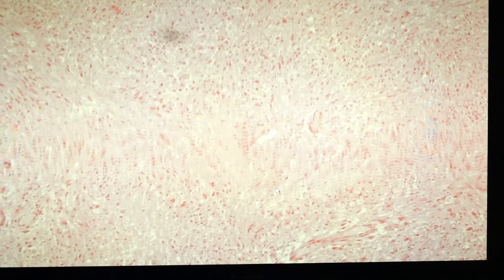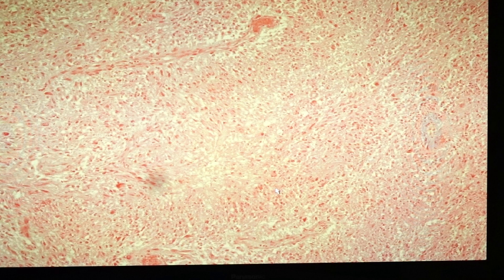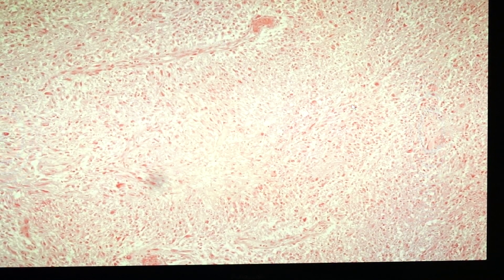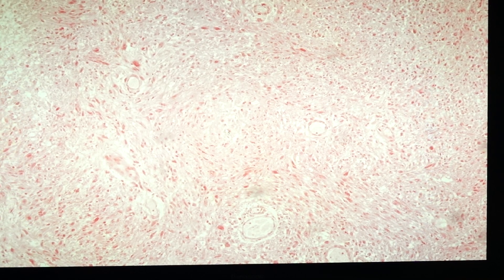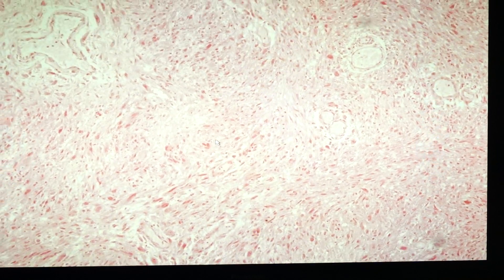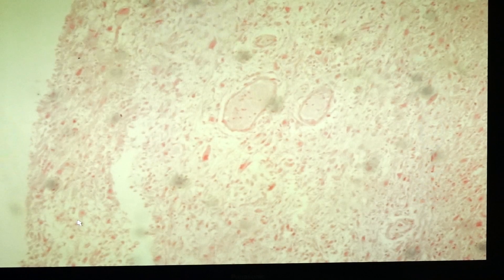Here is another necrotic area in the middle with pseudopalisading of the cells. There are multiple such areas — each is a necrotic area with pseudopalisading surrounding it. There are also aggregates of blood vessels comprising endothelial cell proliferation.